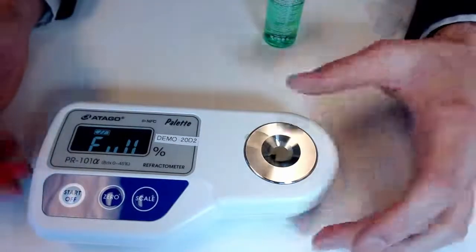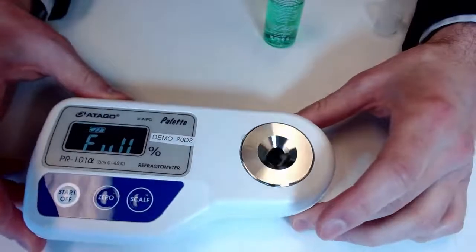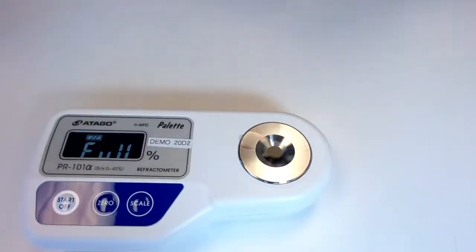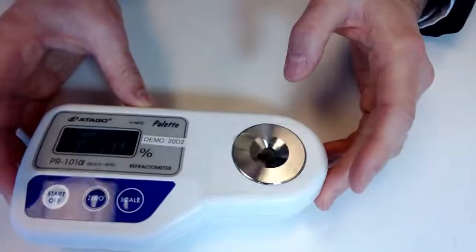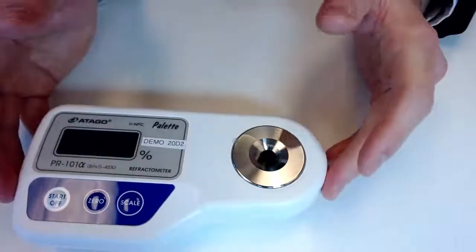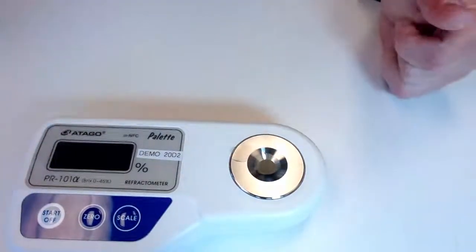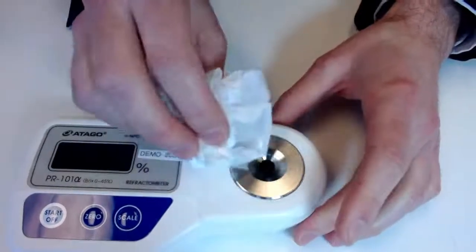We can see we're actually getting full here, which means that our NFC, I have not mentioned our NFC data yet, but this feature is going to store data for you, which is really nice. It gives you the ability to review your past measurements. So with that, you are able to upload to an application, send, review however you like. There are many different application types that will give you the ability to review that. But I do want to note, if you take too many measurements, you're going to have to clear the data. So something to keep in mind there.